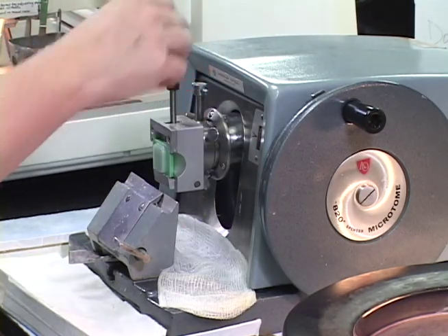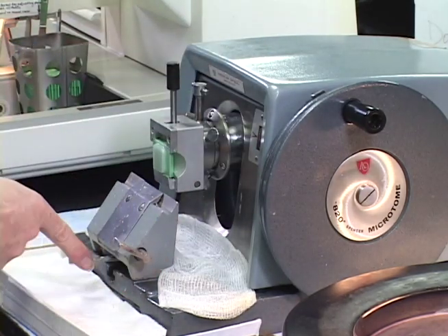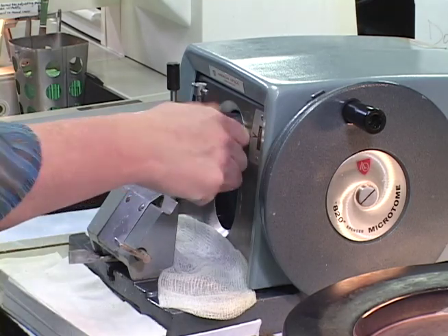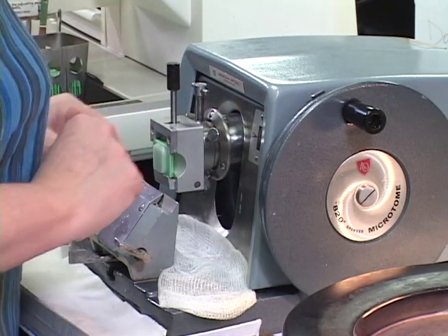And you can just quickly check that. Everything should be just little. You should never have to tighten and crank something really hard. If you do that, you're just damaging the machine, and it's not going to give you good sectional results. It's just really a bad thing to do to super tighten something to that extent. Just a little finger tightening is always enough.